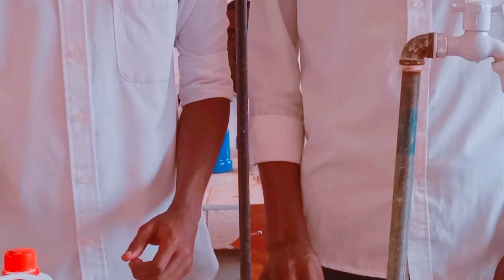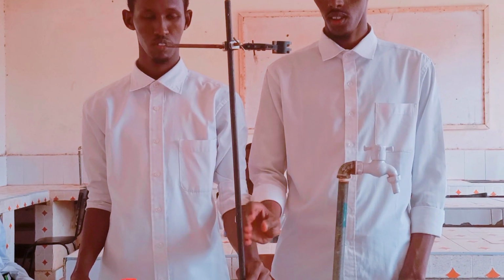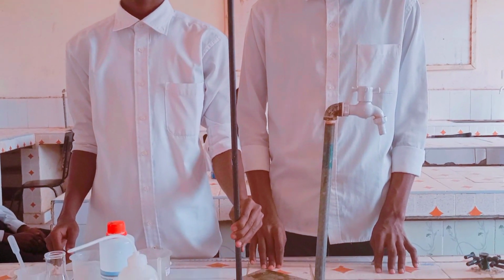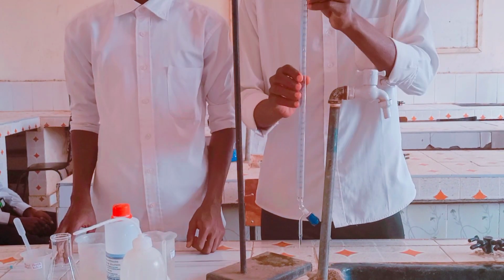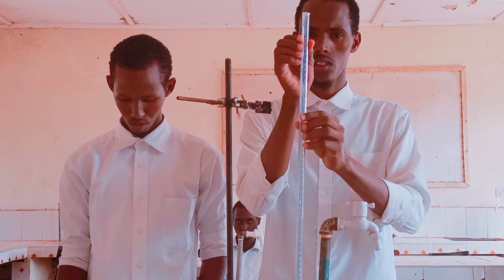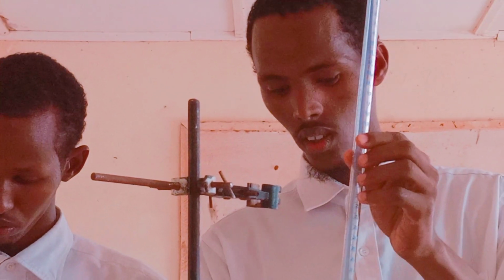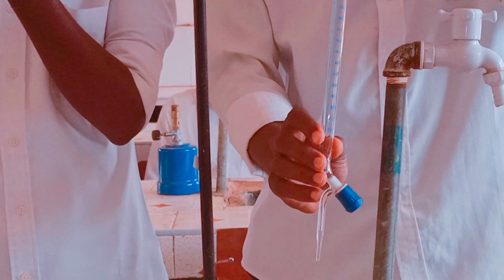Other than that, we are also provided with a conical flask that measures about 250 ml. We also have a complete stand that is used to hold the burette. And then I have a burette there. A burette usually measures from 0 to 50, so that's the 0 calibration. It runs from 0 to 50.